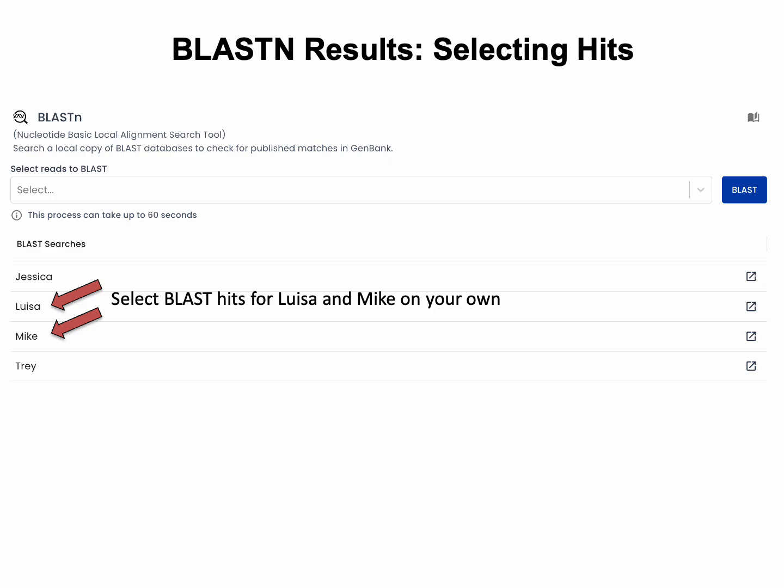So now that you've seen those examples, why don't you go ahead and try selecting the BLAST hits for Louisa and Mike on your own.